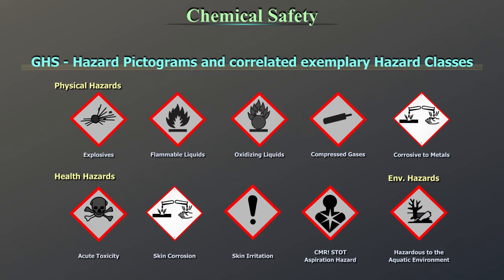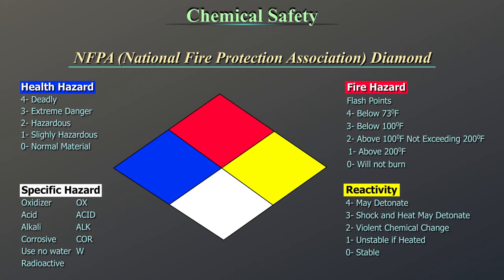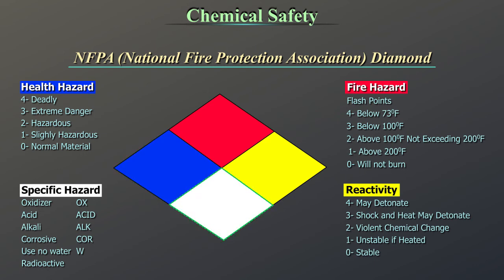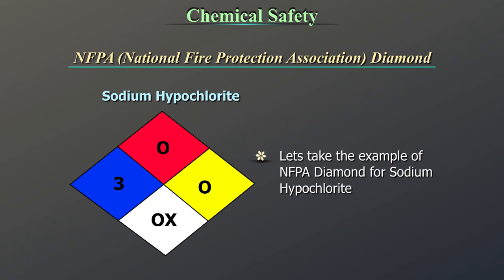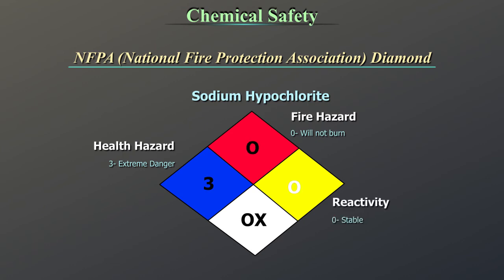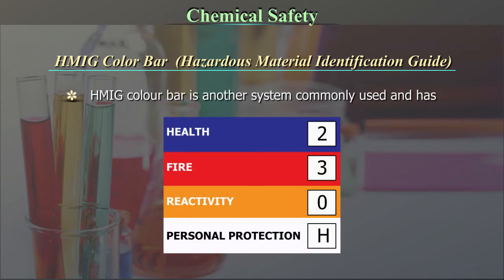The NFPA Diamond — National Fire Protection Association. Another warning system is NFPA. There are four diamonds within one large diamond: red indicates fire hazard, blue indicates health hazard, white indicates a specific hazard, and yellow indicates reactivity. For example, the NFPA diamond for sodium hypochlorite — a commonly used chemical in all labs — shows category 3 for health, zero for fire and reactivity, and oxidizing under specific hazard.